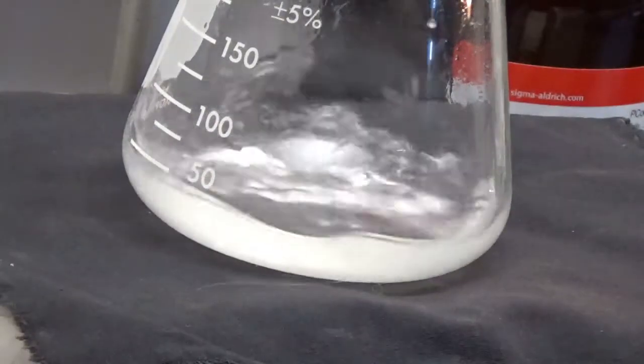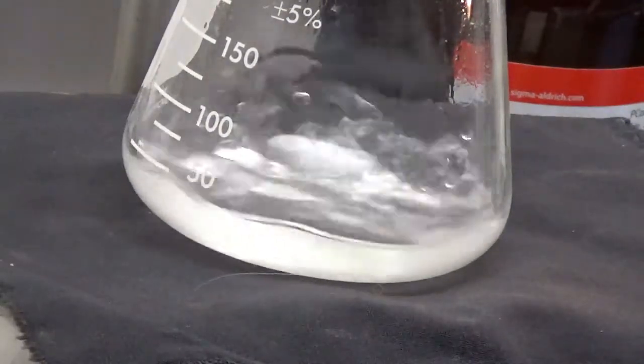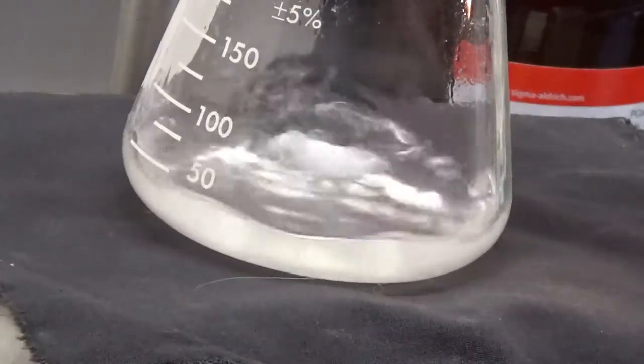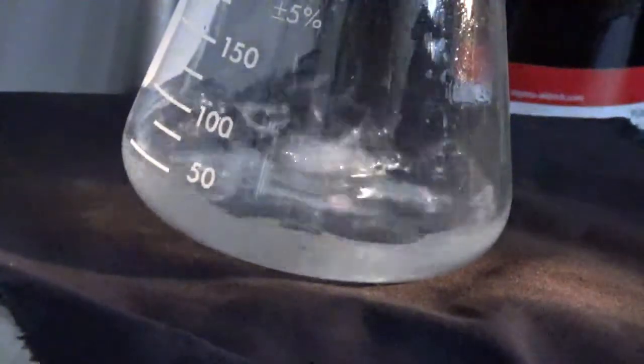But I'm going to add a few more drops because I still think it looks a little cloudy. Of course, then I went nuts and added like way more than just a few drops. Still looks cloudy to me.